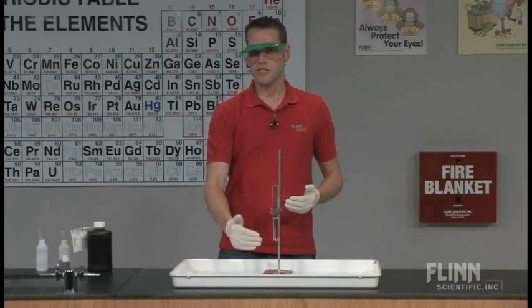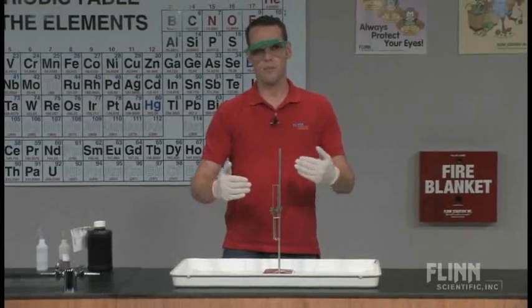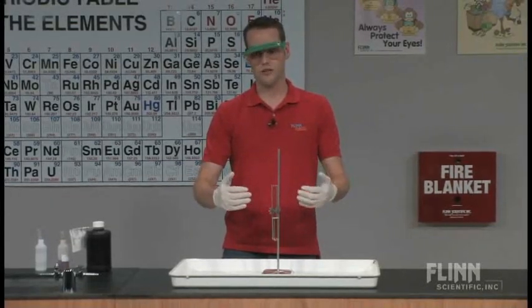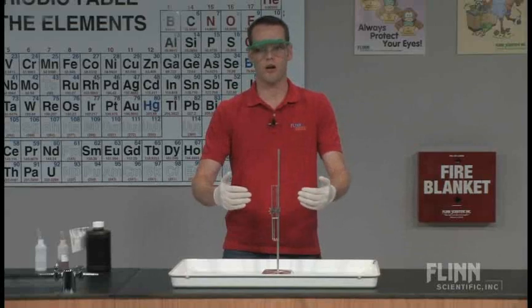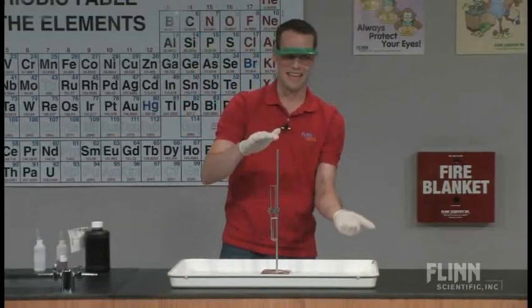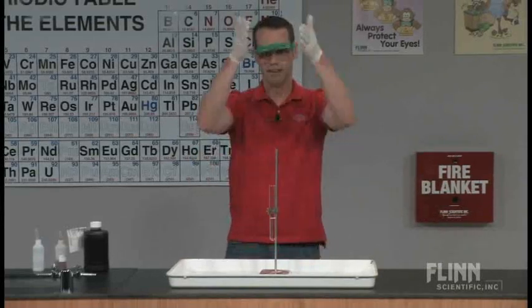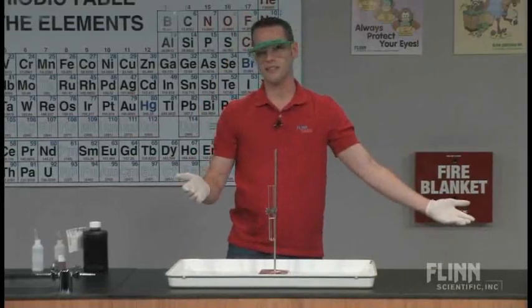You'll also notice that I have the test tube vertical here. This is the way we always tell our students never to heat anything. But for this reaction, because it's going to generate a lot of gas and will eventually explode upward, I want it to go straight up and come straight down. In this case, I don't want it to be angled. This is not a lesson in projectile motion. We want things to go straight up and down, not across the entire countertop.